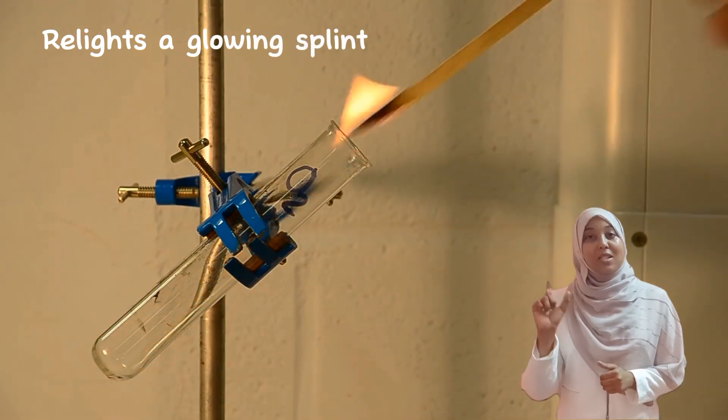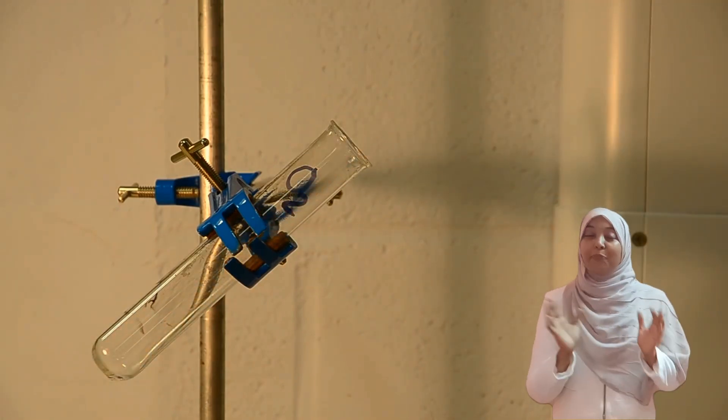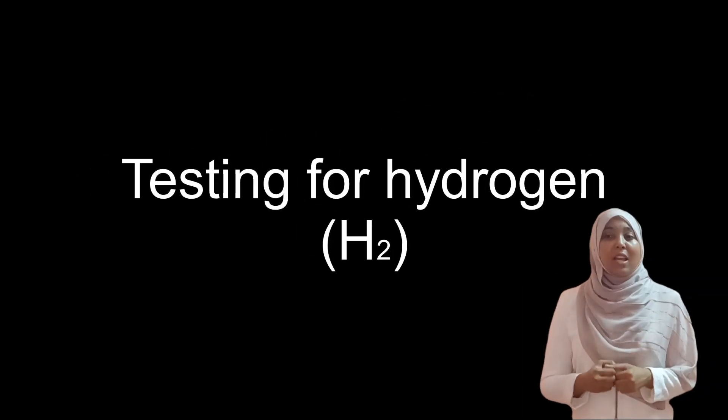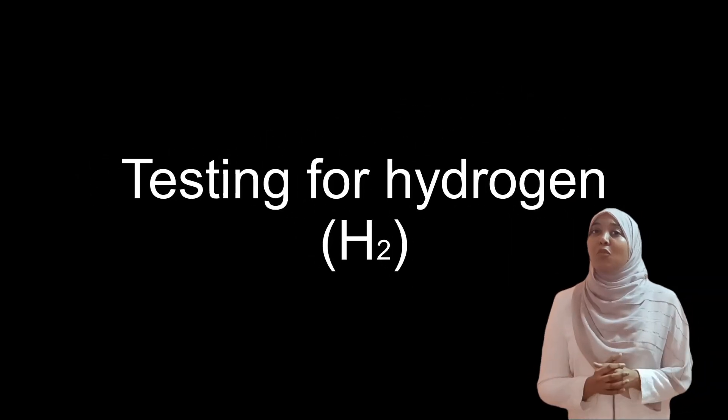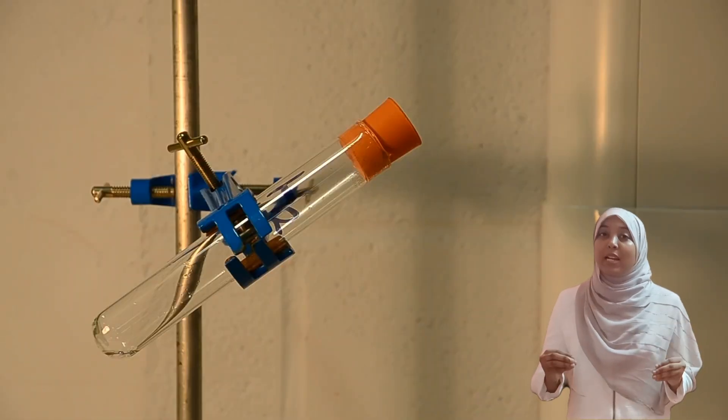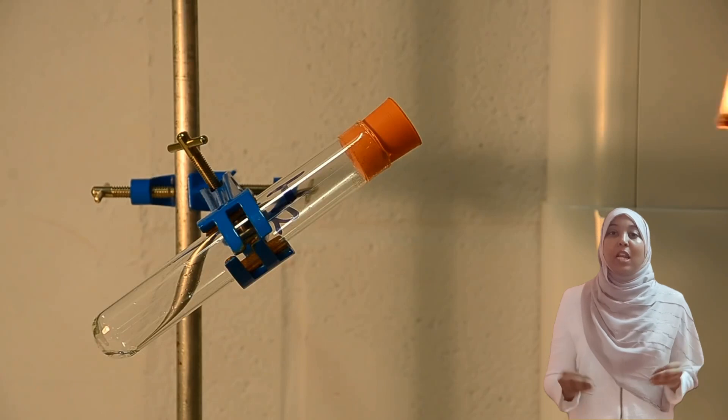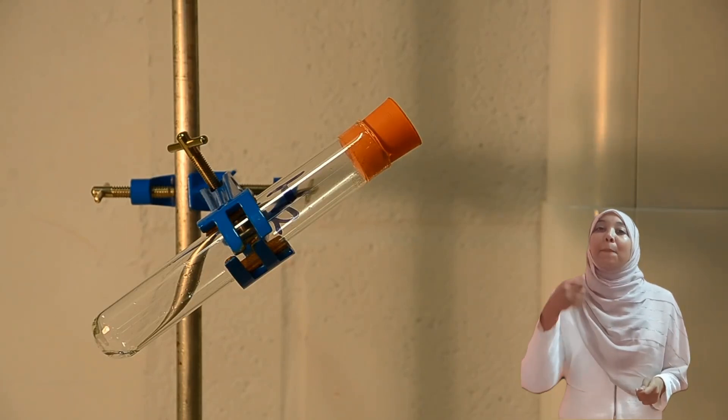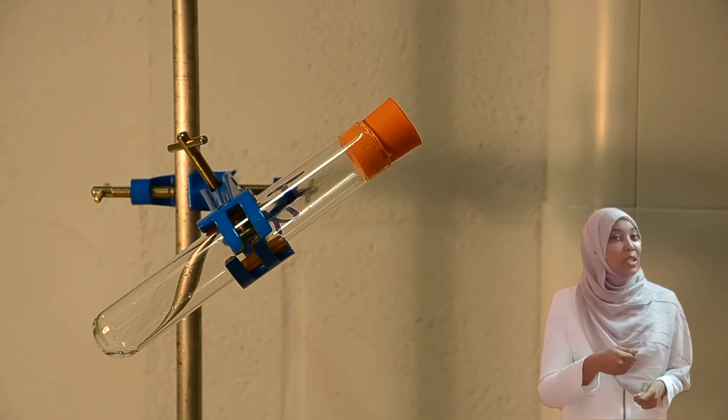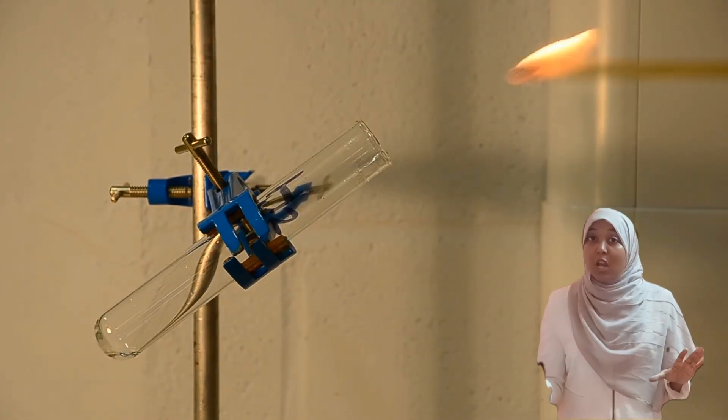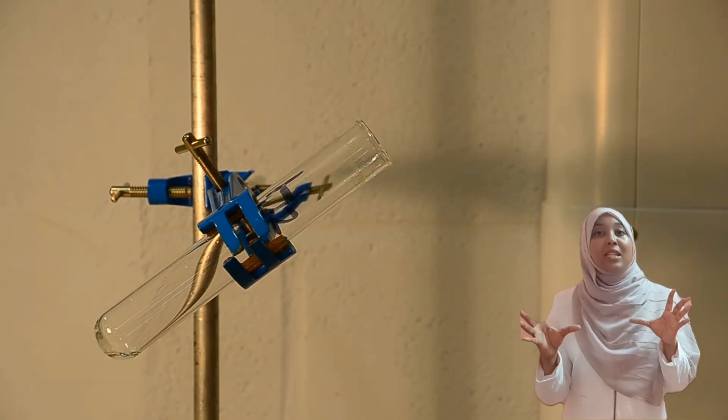Moving on to the next gas: hydrogen gas. If you want to test for the presence of hydrogen gas, what do you use? You use a burning splint. So you're going to take a wooden splint, light it on, and then place it into the suspected container. Now, if the flame goes out with a pop sound, then that is hydrogen for you.